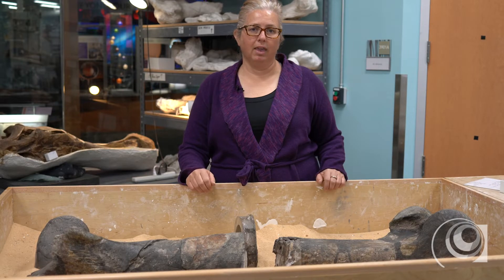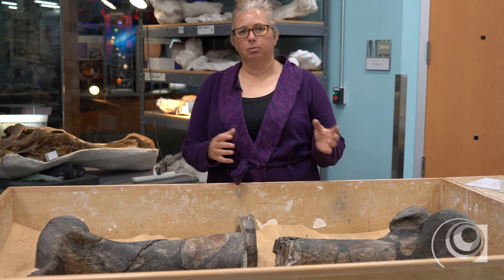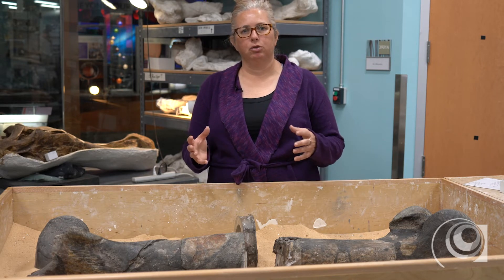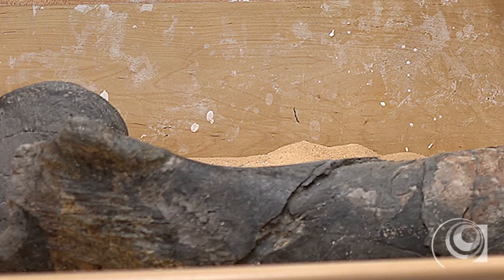So what we have to do for that is cut the specimen in half. Before we go through this whole process, we consult with other members of the department to make sure that this is a worthwhile venture because it is a destructive process.